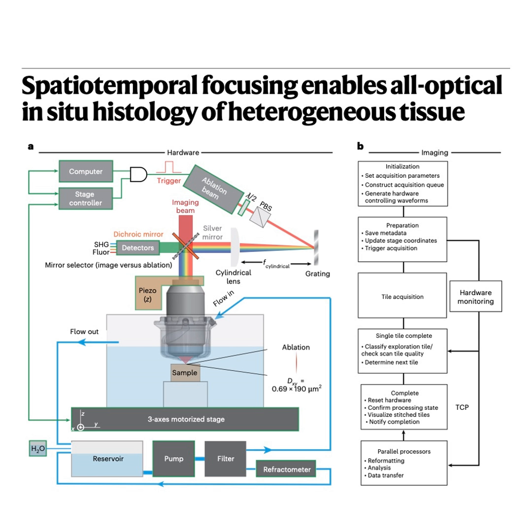Bad enough to completely ruin the experiment. The paper notes that even a small change in RI can shift the laser focal spot vertically by over 100 micrometers. Whoa. When you're aiming for cuts only 6 microns deep, a 100-micron focal shift is game over. Totally unacceptable for submicrometer precision histology. So they couldn't just hope for the best.